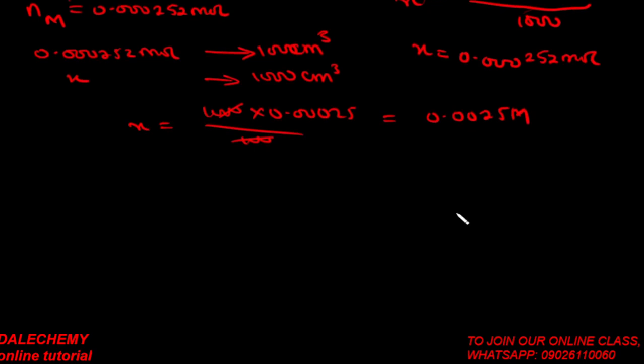Now to get for calcium only, then to 100 cm cube of tap water, as in your manual, you still add 2 cm cube of diethylamine, or you use 2 cm cube of sodium hydroxide. The meaning of that is that you want to use it as a masking agent, because you want to determine the concentration of calcium only, and in your tap water there will be calcium and magnesium. So you are going to add masking agents to render that magnesium unreactive.